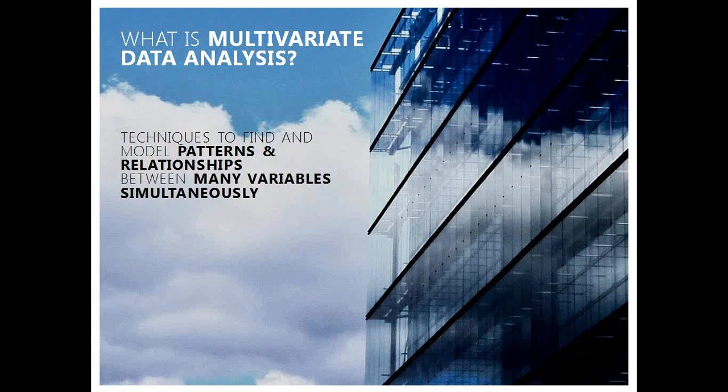Thank you, and welcome to today's webinar, where I'll be talking about multivariate analysis and showing you an example of using this within the Unscrambler X software. So what is multivariate data analysis? It is a combination of techniques that allow us to model patterns and relationships in our data between many variables simultaneously, so that we can, from this, extract the information from the data that we've collected.